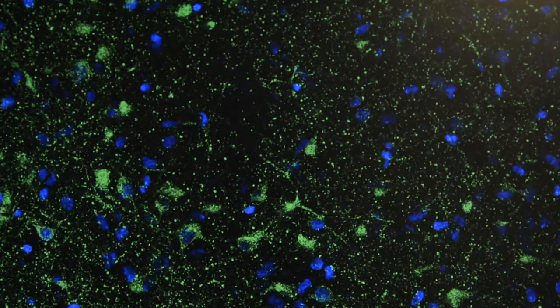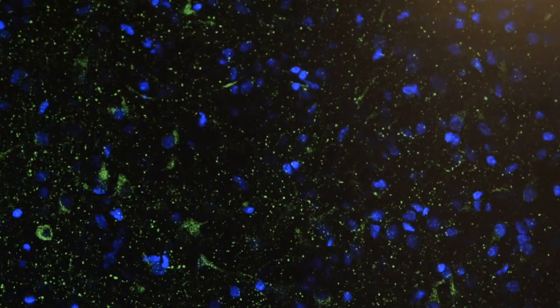The environment that the bit in your toe is exposed to versus the environment in your spinal cord are radically different. So when you're screening things, or you're looking at mechanisms going on in the different compartments of the cell, there's no guarantee that what goes on in one region is going to be exactly the same as what's going on in the other region of the cell.